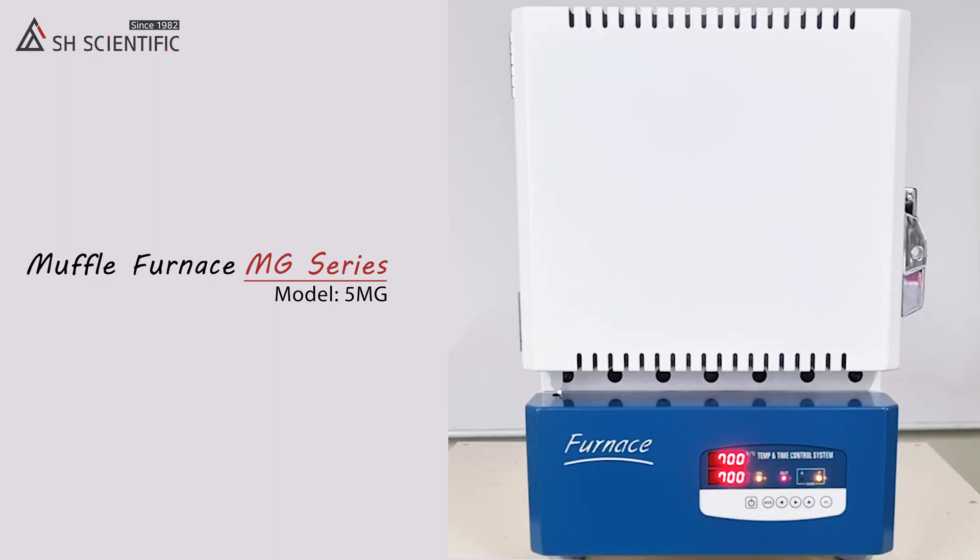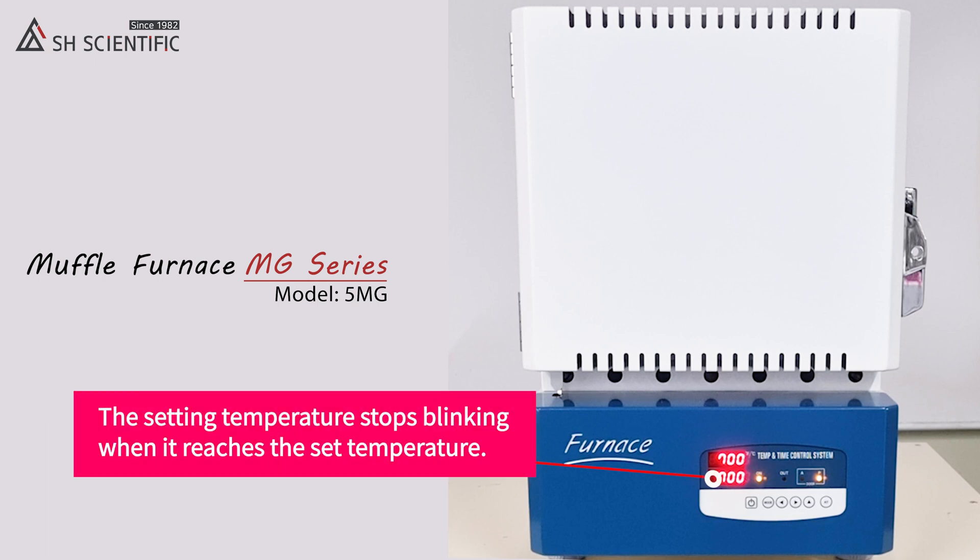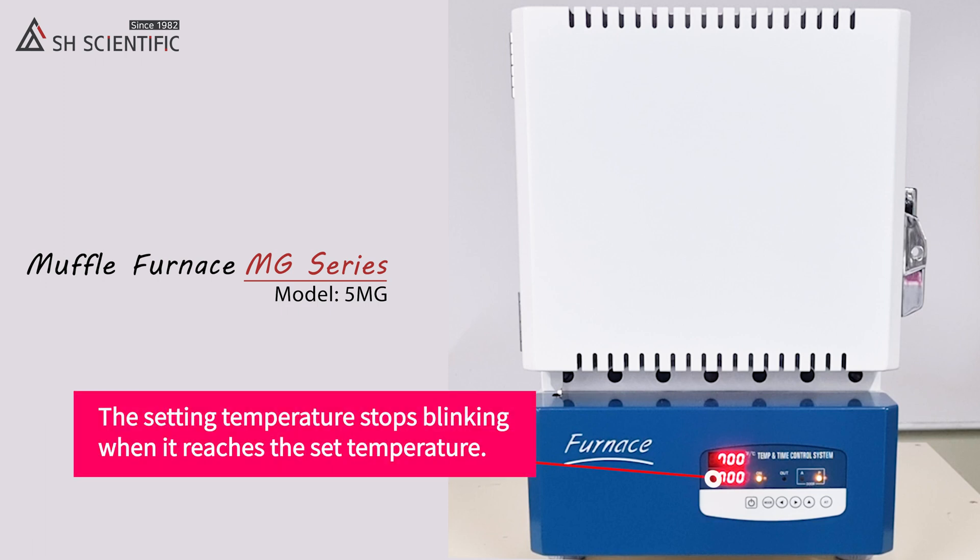Look how quickly it gets to the set temperature. We're just 23 minutes in and it's already at 700 degrees Celsius. Now the set temperature is not blinking, which tells us it's up to temperature and the heater is going to stay right at this level.